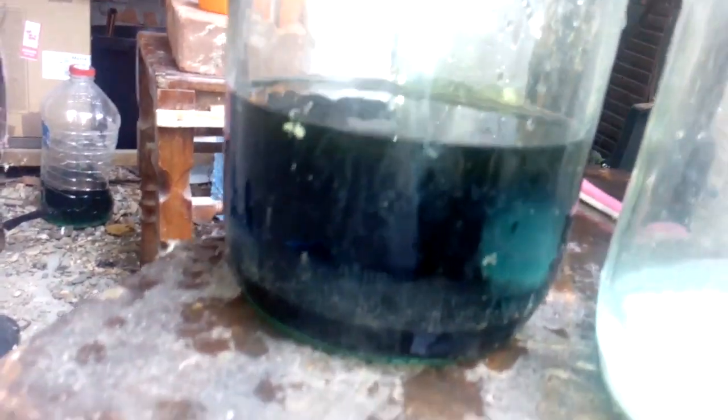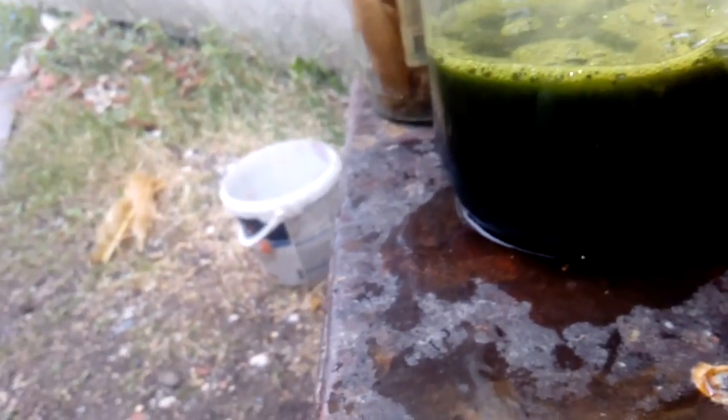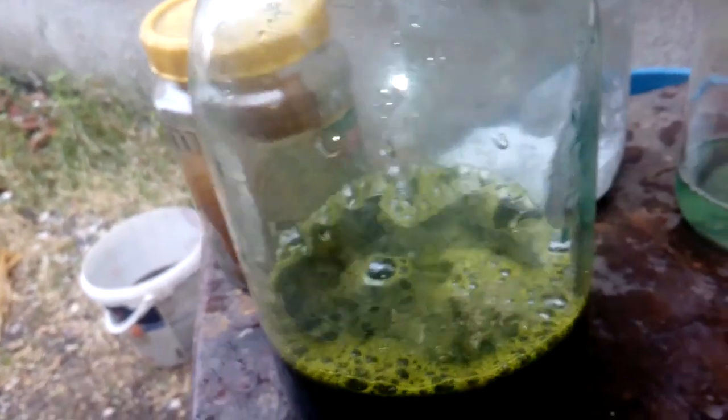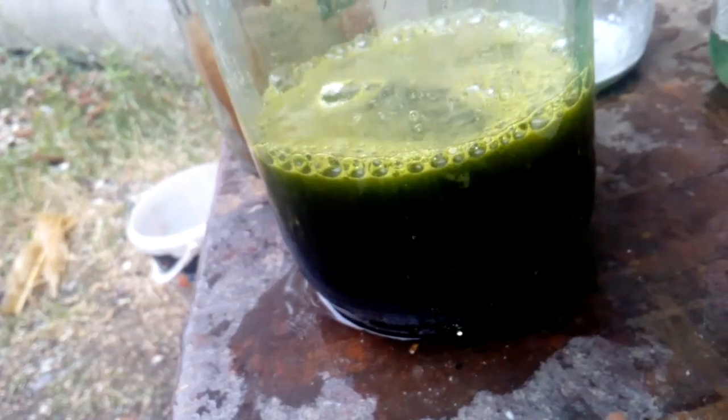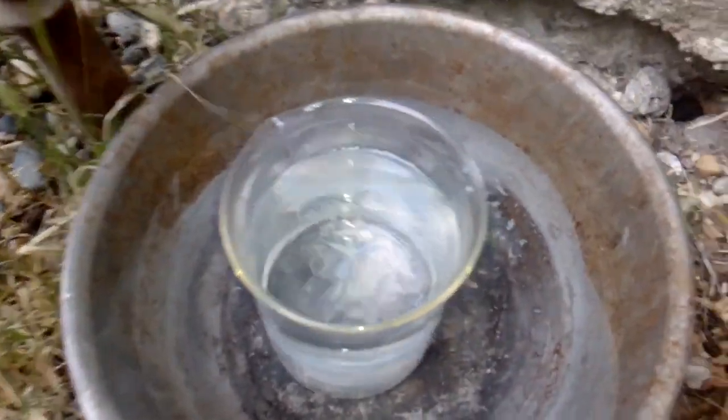Now we let it cool and drop some gold. We add some urea to neutralize the nitric acid — you add urea till you get a reaction. This is a new tip for you guys: I dissolved some SMB in hot distilled water, and now we drop some gold. It's not very hot, maybe 50 degrees.